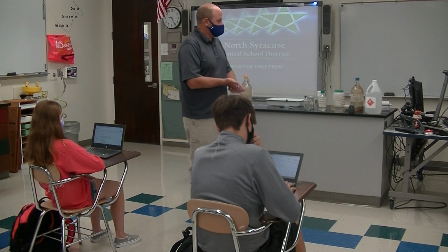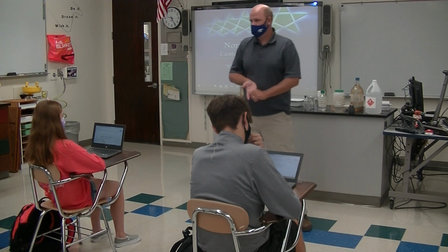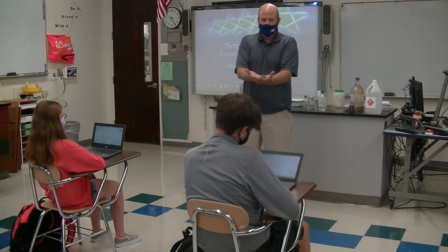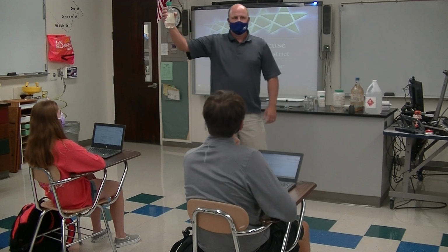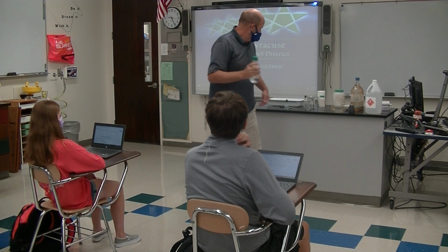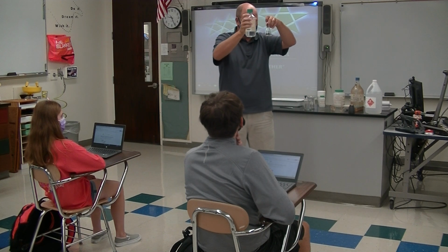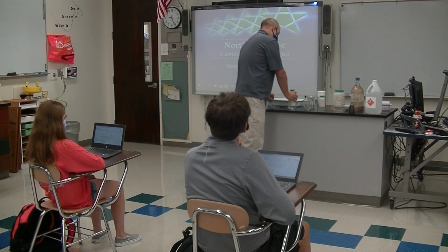All right. So acid. We'll think of orange juice, the very concentrated acid of orange juice. Have you ever spilled orange juice on you? We have to know how to detect if we have an acid on us. Like everything, if I show you, is this an acid? Can you tell by looking at something if it's an acid or not? I will tell you that one of these two things is an acid. If you just look at the liquids, don't they look the same? Yeah. So you can't tell just by looking at something that it's an acid. So how do we tell if something's an acid or not?